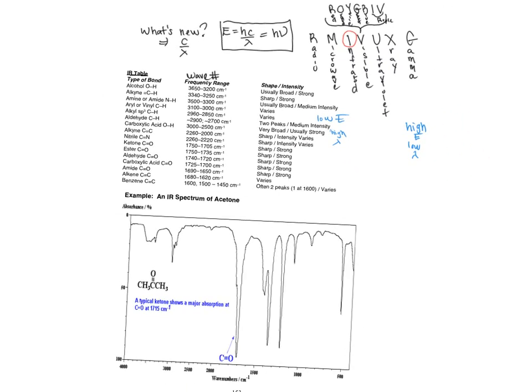So there's acetone, and there are a lot of peaks there. And here's the annoying thing about IR: you actually are not supposed to identify most of the peaks. You have to find the peaks you expect to see and justify them. The extra peaks will be there beyond reasons that we're going to go into in this class. And so the way we're going to keep it kind of simple is to say, okay, well, if I have a known and I'm trying to explain what's there, I need to write out everything, even all the bonds. So that wasn't a good enough job with acetone yet. I'm going to write out even more information.